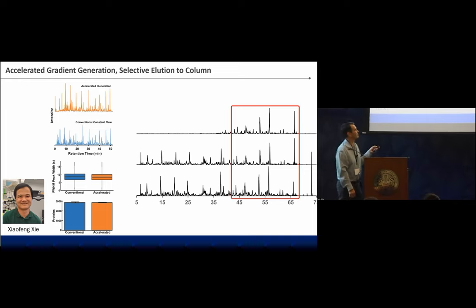Can you comment a little bit about the missingness with the wide window DDA isolations? Yeah, so I don't have exact metrics off the top of my head for that, but it's lower, right? Because it's also not a smart method. It's just doing DDA and saying, what else do I happen to gather with a wide window rather than a 1.6 or 0.7 Dalton window? And so it's not smart, but we have a huge number of PSMs with that method. I can't remember how many, but a lot of PSMs.